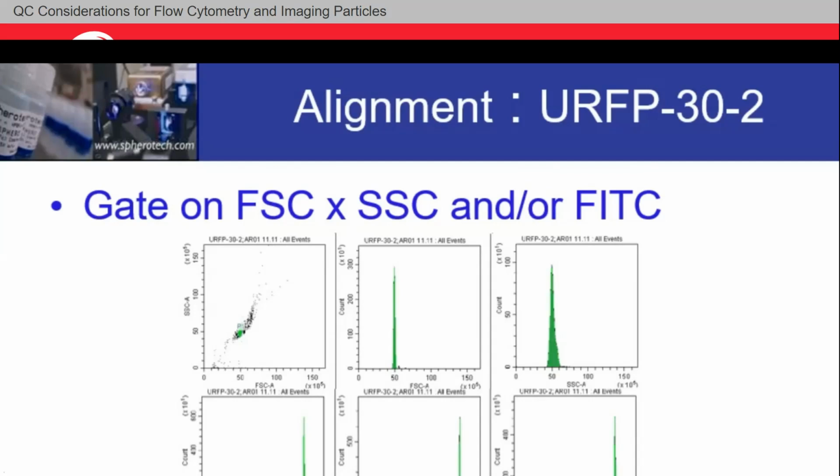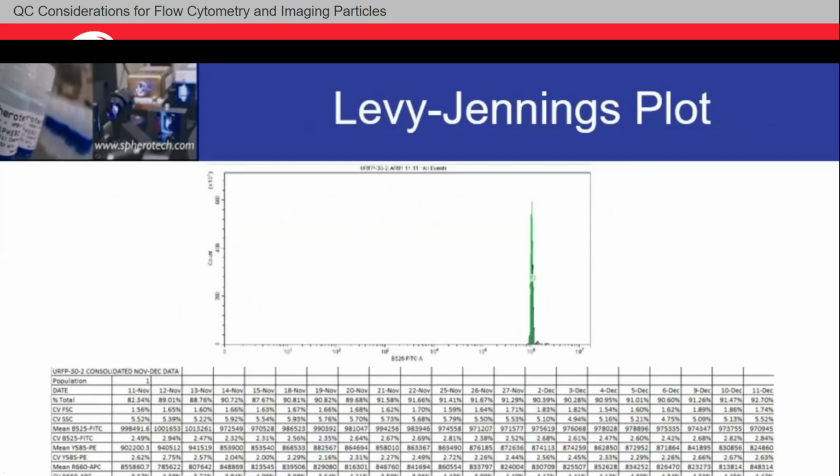And as we're seeing, we set up the one gate and we ran them continuously from November through December, at least 30 days. I would love to have 60 days as you continue to make your pile of data more robust, right? But at the very least, you would want to have your instrument set up by, let's say, your Beckman Coulter Life Sciences tech. You would want to do maybe a PMT if you already have an instrument in-house and you're not sure exactly where it should be.